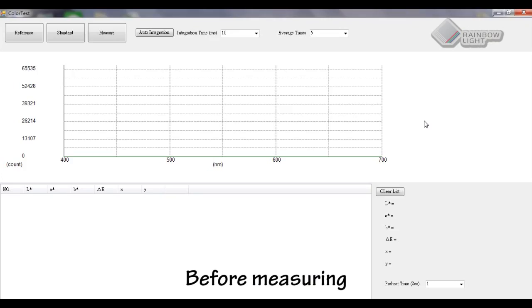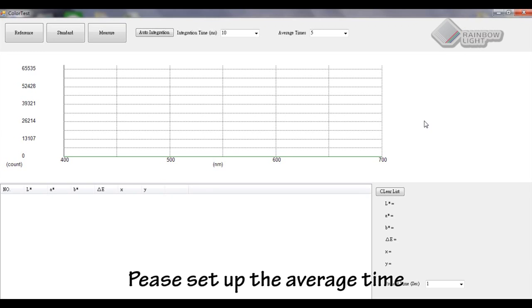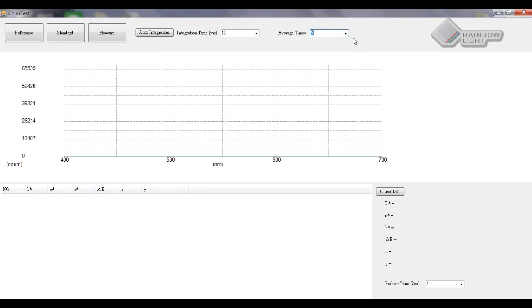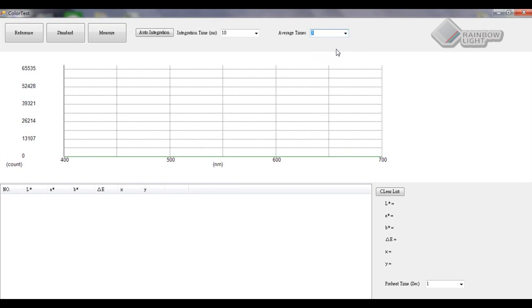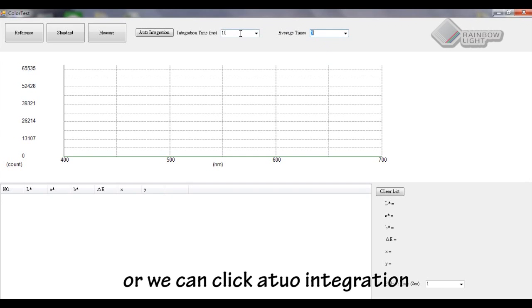Before measuring, please set up the average time and integration time, or we can click auto integration.